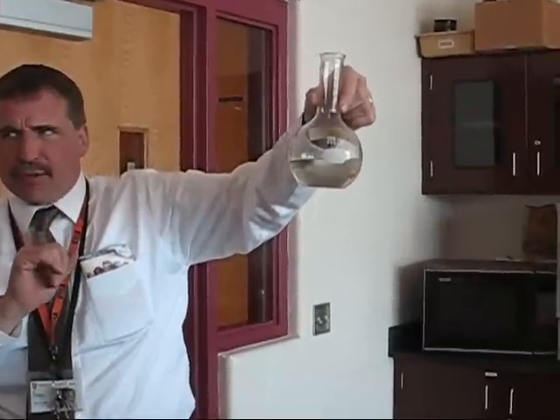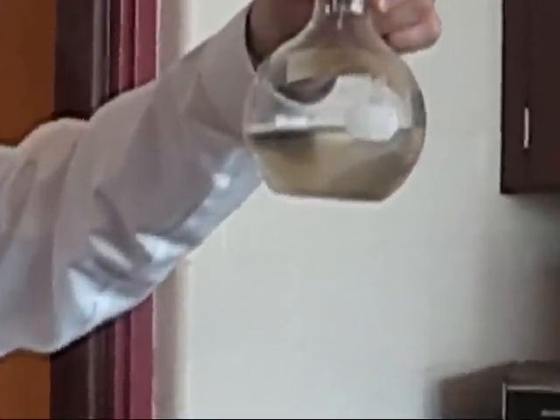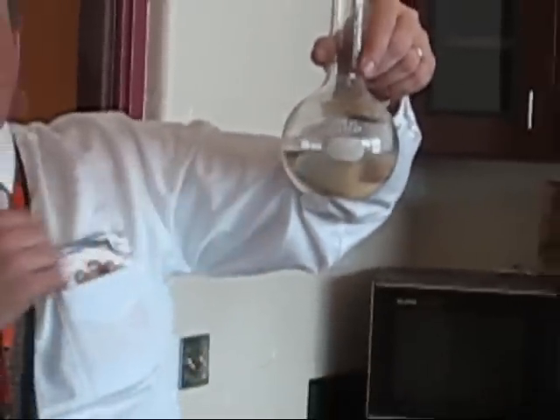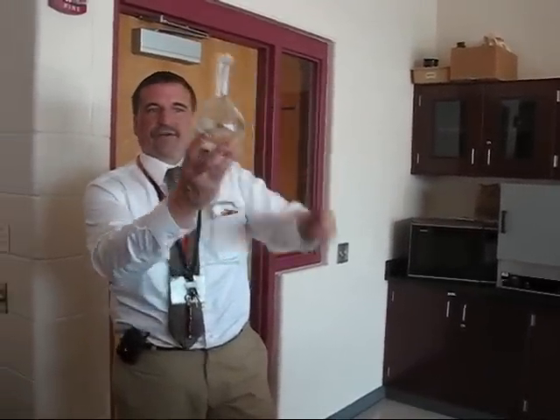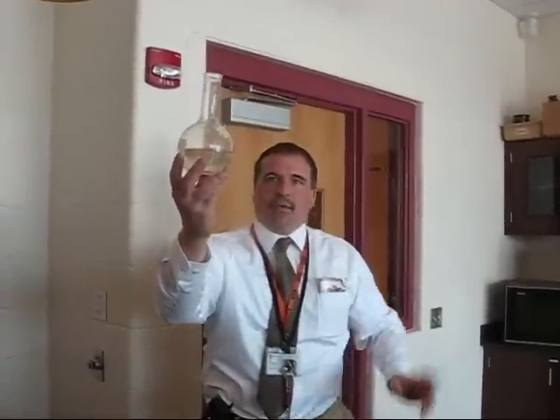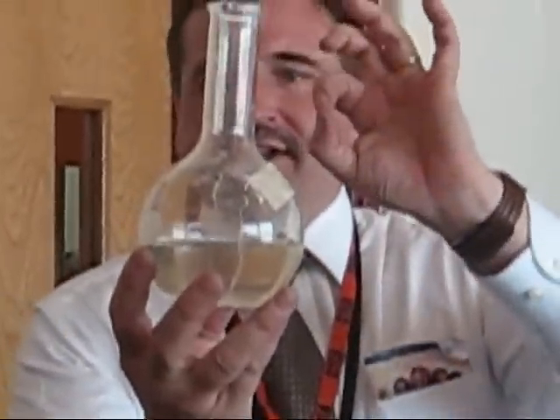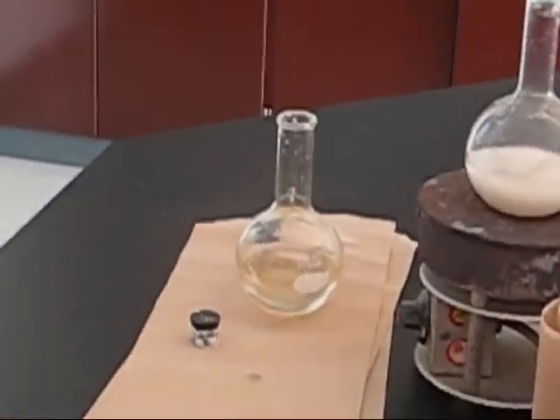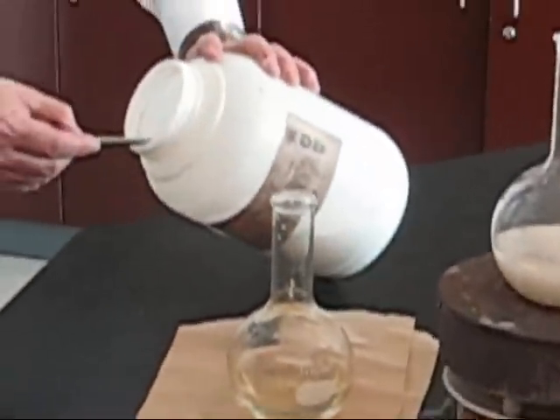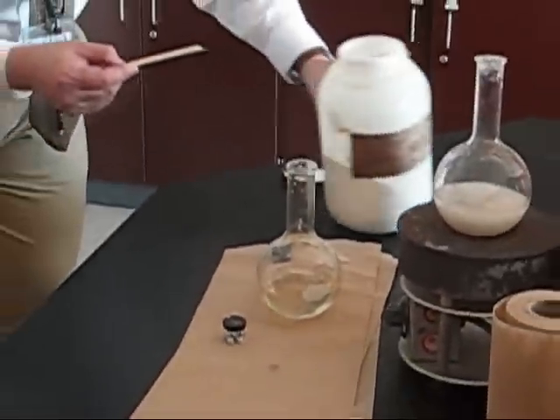Any small disturbance will make all that extra stuff that shouldn't be dissolved at this temperature — and it's room temperature — crystallize out. So how do we set off the crystallization? If you shook it... I want to put a seed crystal in. It only takes like one little crystal — here's the solid that I used to dissolve it. I'll probably put more than I need to get in there.